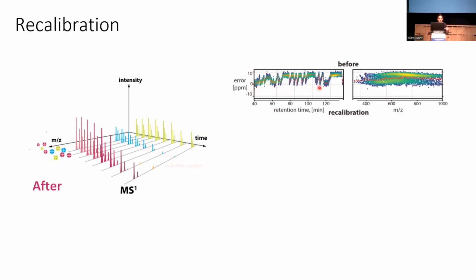So when you plot them, you can see that you have this very wiggly line. It doesn't mean that it's always going to be like that, but it could be. So you have these really systematic errors that a mean will not save the situation for, for sure. So you have to do something about it. Also, it's not only this plot with the retention time on the x-axis, but we do the same with the m over z on the x-axis.